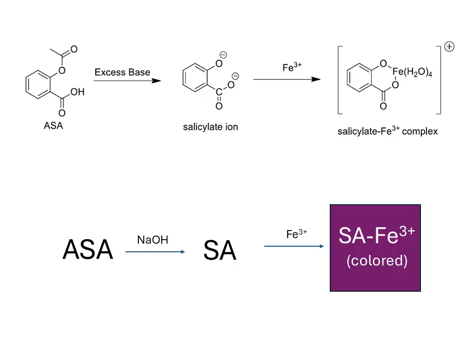For the purpose of this presentation, acetylsalicylic acid will be abbreviated as ASA, the salicylate ion as SA, the salicylate iron 3+ complex as SA-Fe3+. Note that the mole ratio is 1:1 for each transformation.